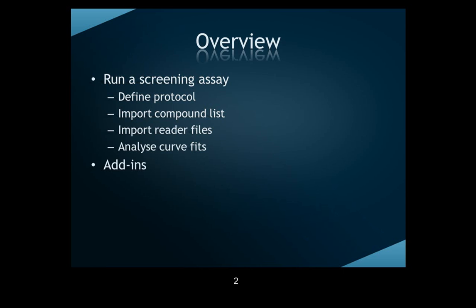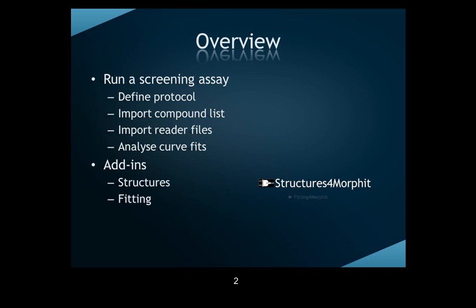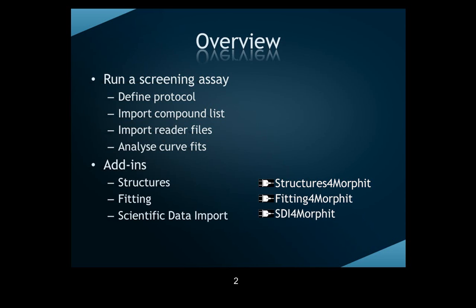The add-ins that we're using here are the Structures for Morphit add-in that renders SMILES and MOL file data, the Fitting for Morphit plugin, which uses the data in the Morphit sheets to apply non-linear regression combined with the charting functionality, and SDI for Morphit, which was used to import the reader files.